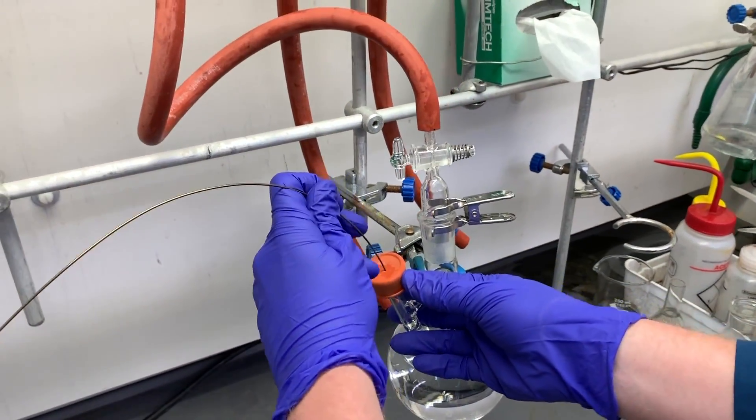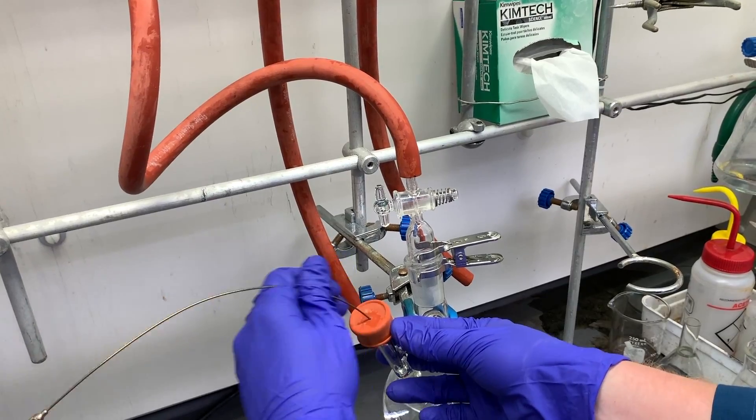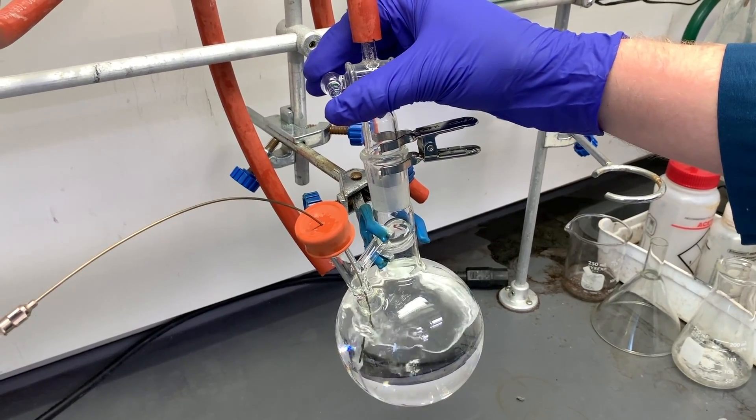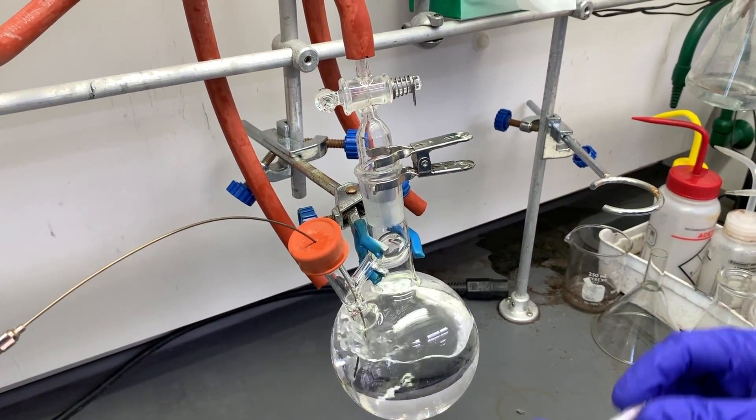With nitrogen flowing out of the long needle, insert it into the flask and below the surface of the liquid. You can close the flask's nitrogen inlet and insert a pressure relief needle to ensure a moderate flow of gas through the liquid.